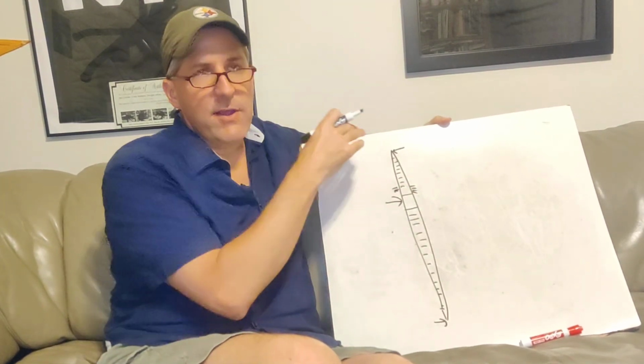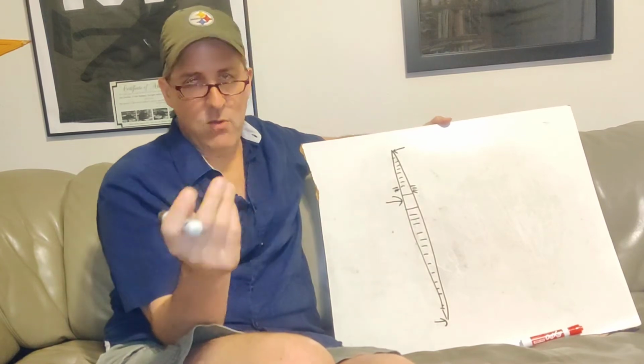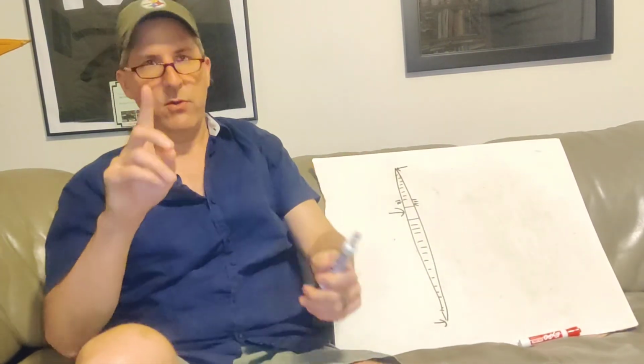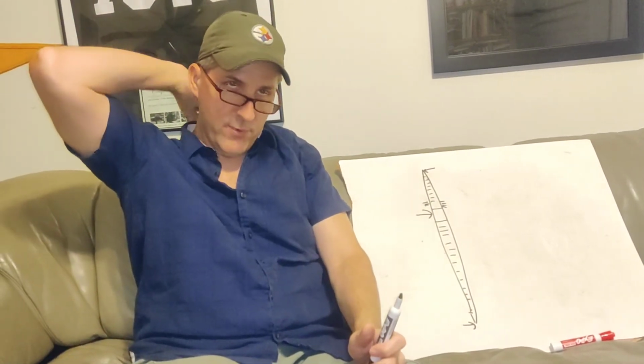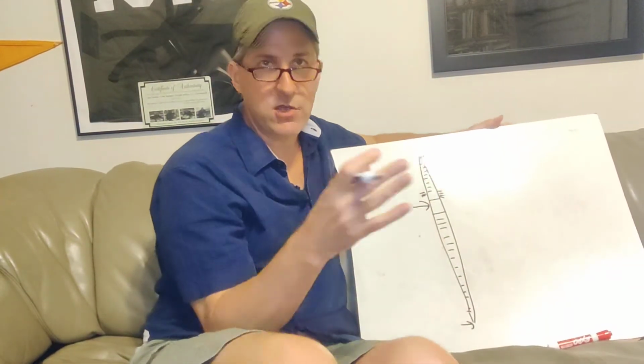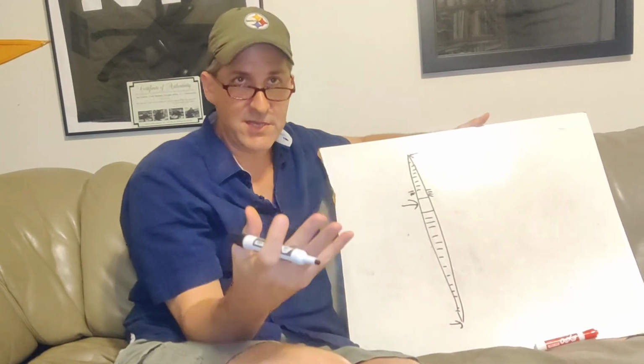Why? They're going to have a nerve cord, a spinal cord, but it runs along the ventral side, their belly side. So imagine your spinal cord wasn't on your dorsal side. You don't have vertebrae. You would just have a nerve cord that runs down your belly. So I would tell you to come in from the top side so that you don't cut the ventral nerve cord, so you can see it.